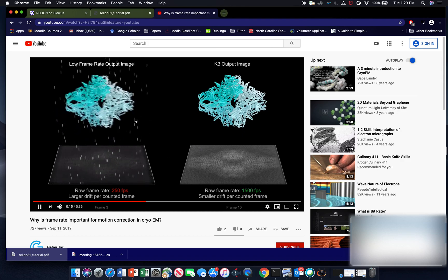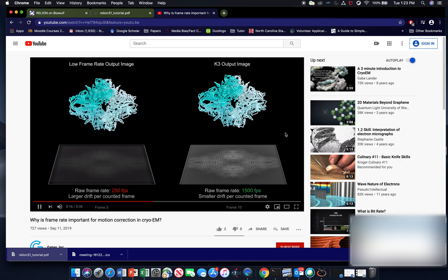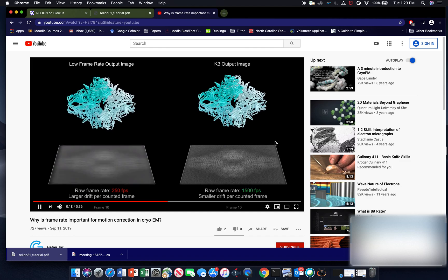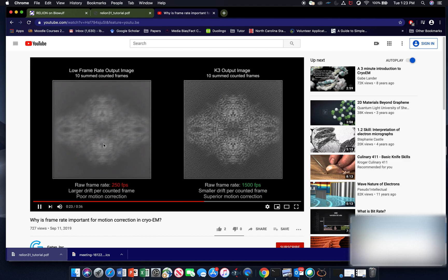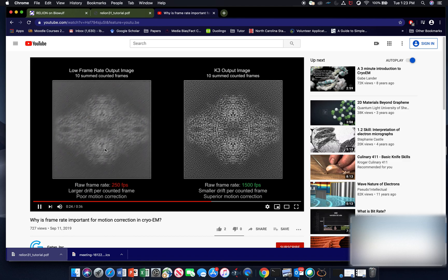So this is showing the effect of different detectors on overall resolution. But you can see the vibrating image that wasn't motion corrected came out to be blurrier than the motion corrected image.